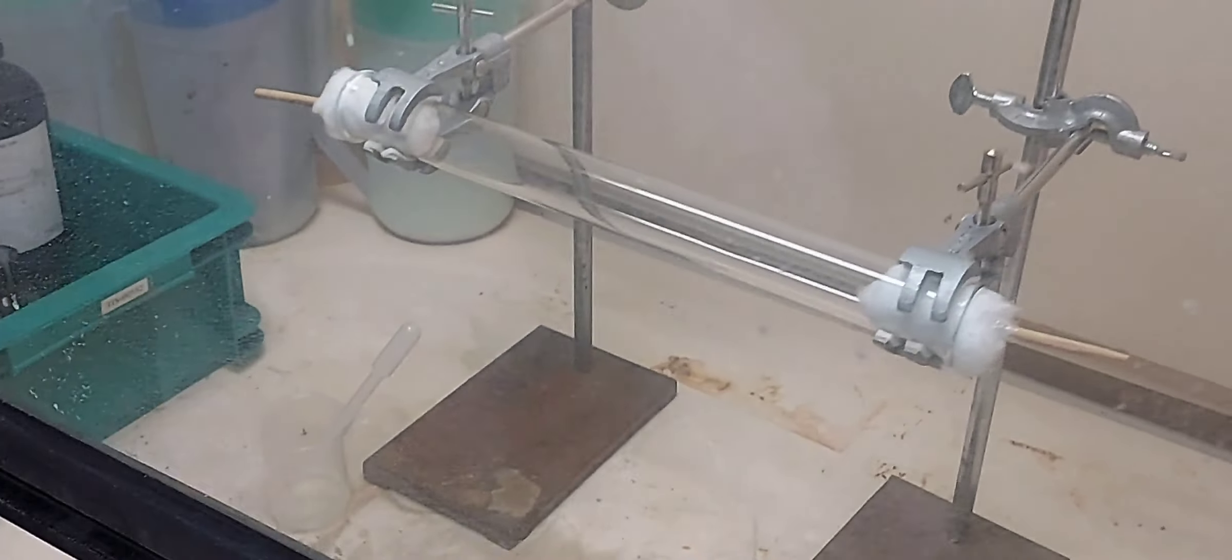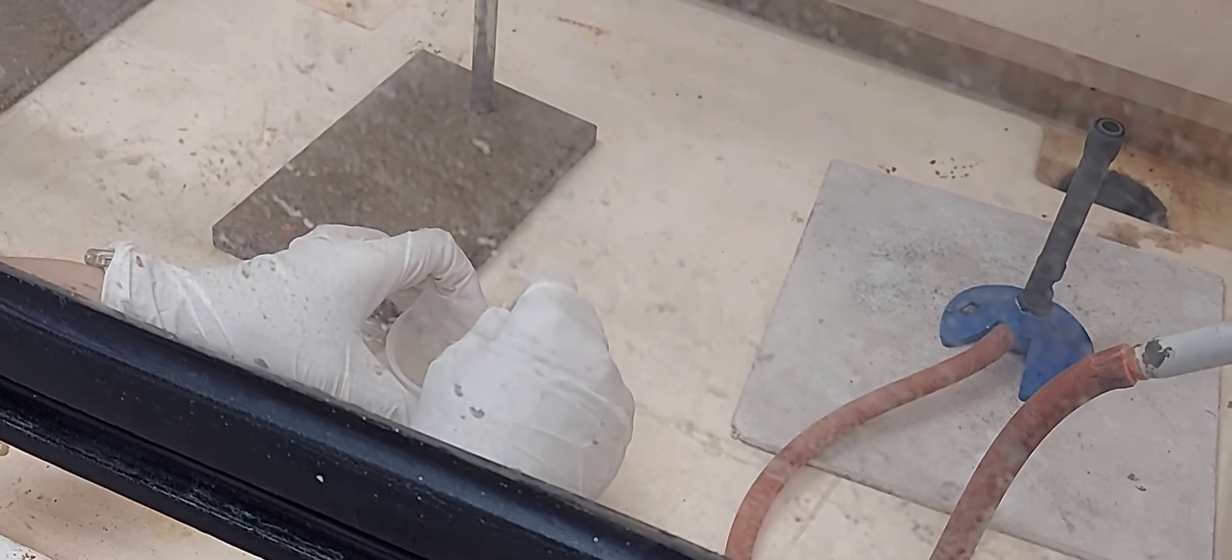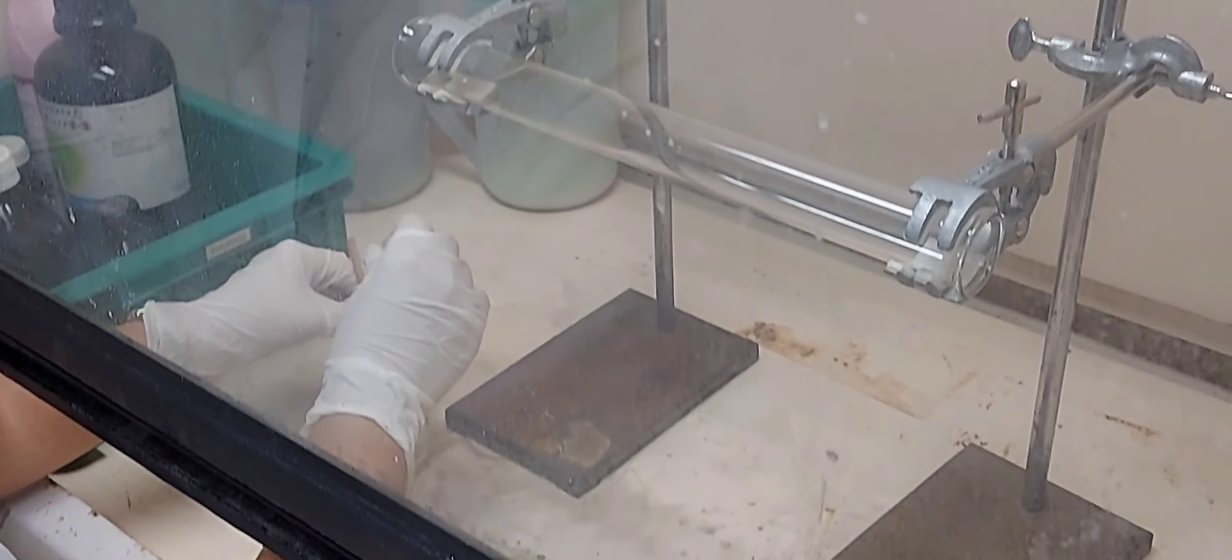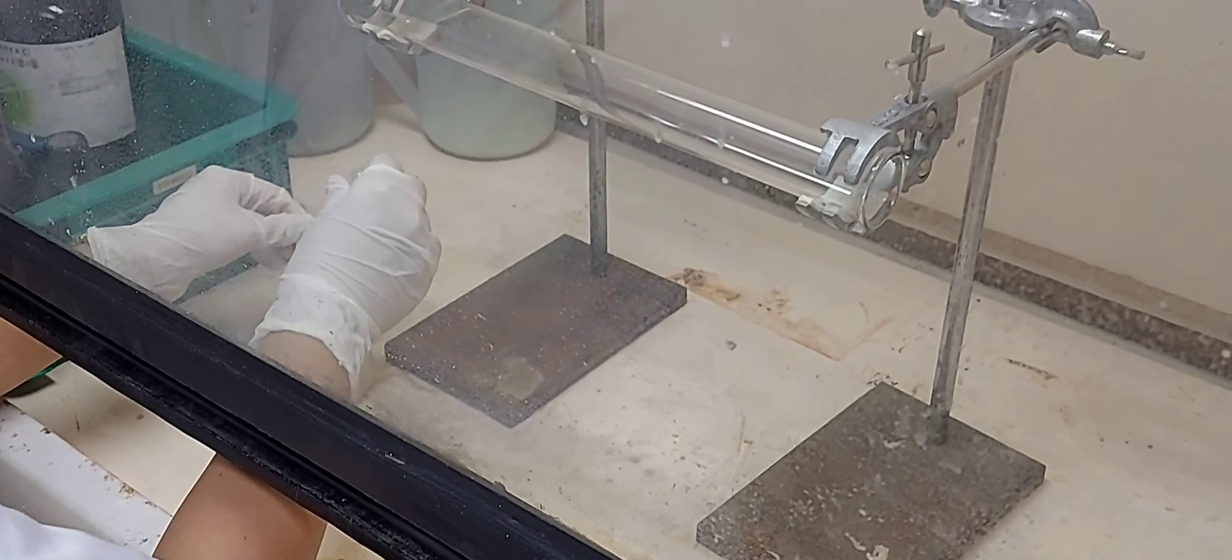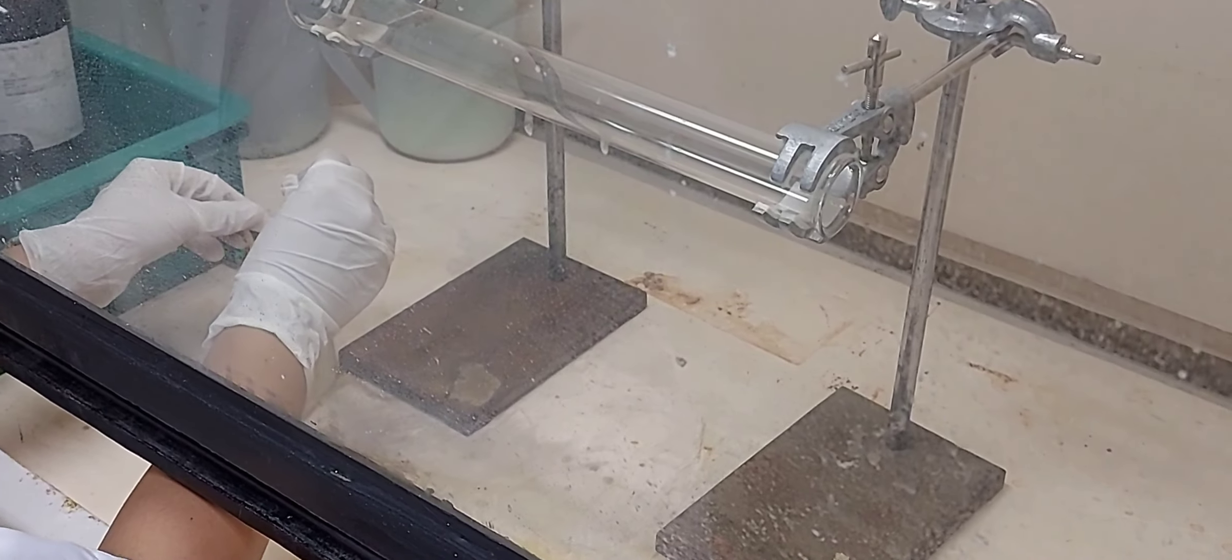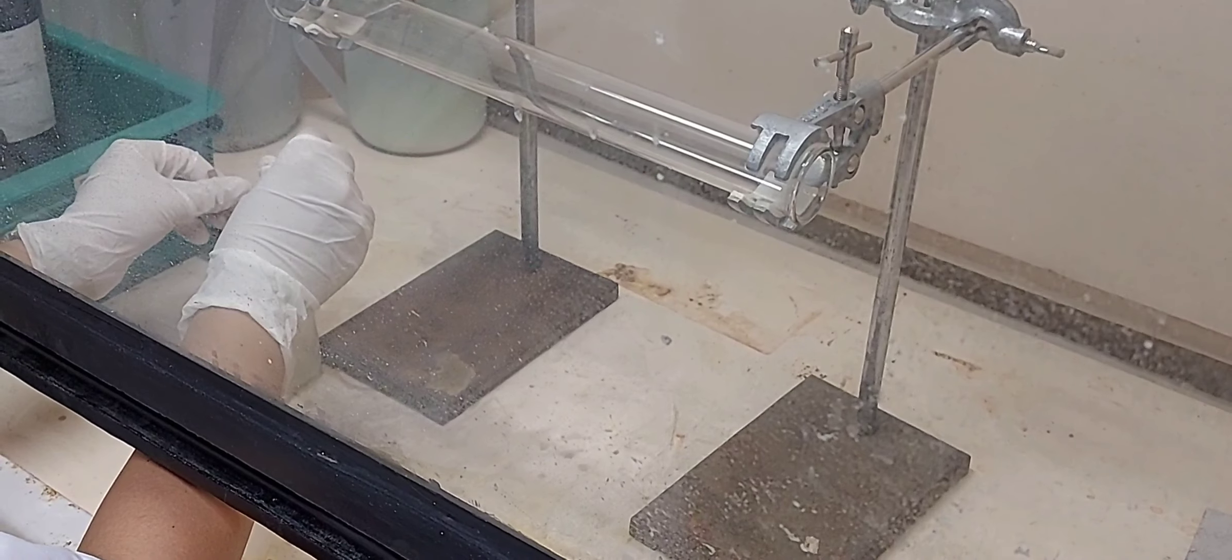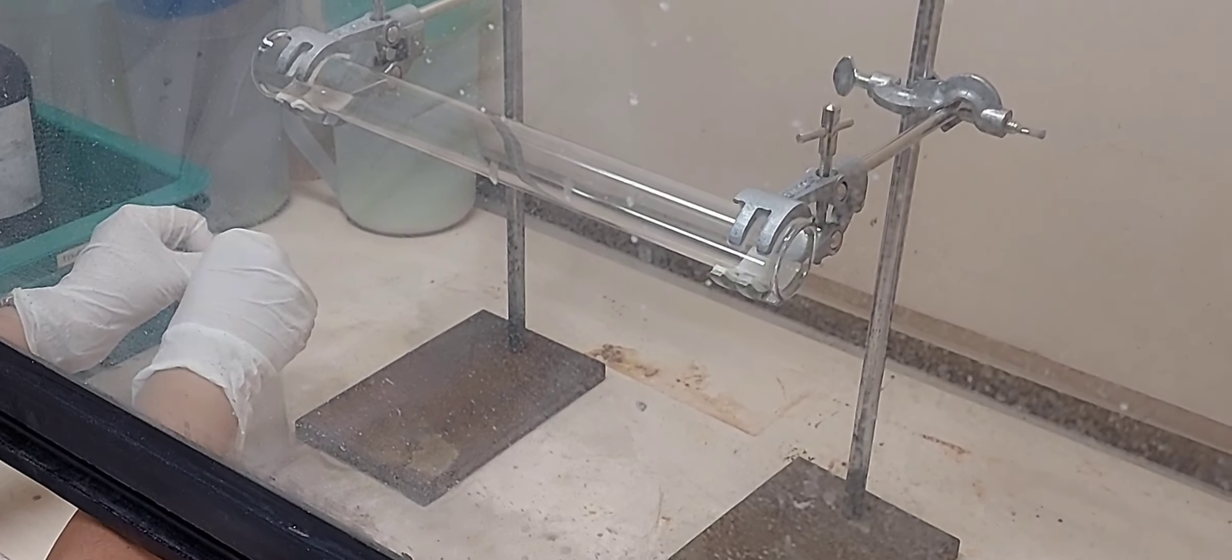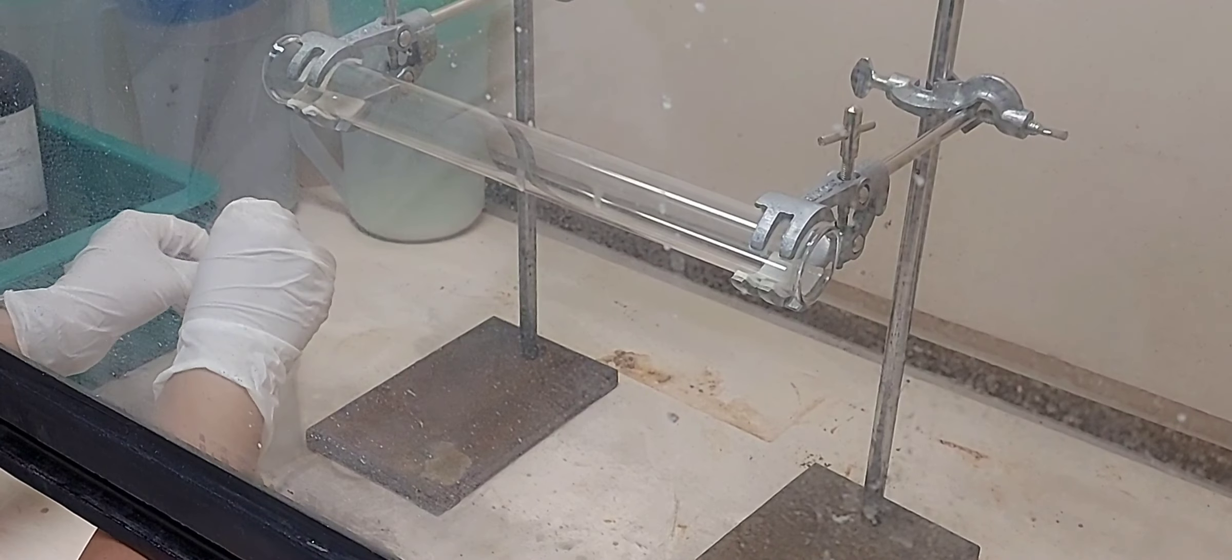So you have the apparatus set up. We have a long open tube. The tube is open at both ends and the cotton wool is dipped in the two solutions. Concentrated HCl on the left hand side and ammonia on the right hand side.